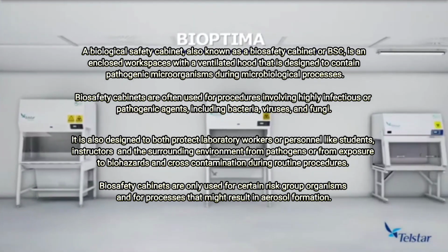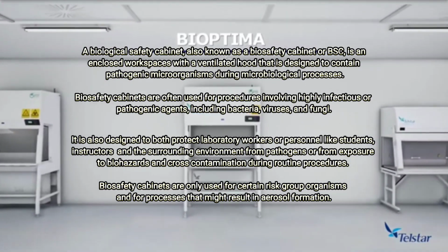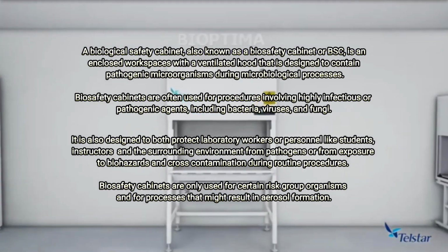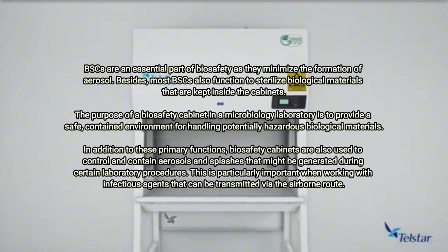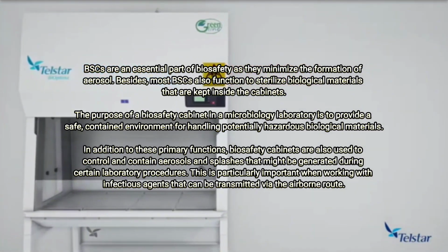Biosafety cabinets are only used for certain risk group organisms and for processes that might result in aerosol formation. BSCs are an essential part of biosafety as they minimize the formation of aerosol. Besides, most BSCs also function to sterilize biological materials that are kept inside the cabinets.